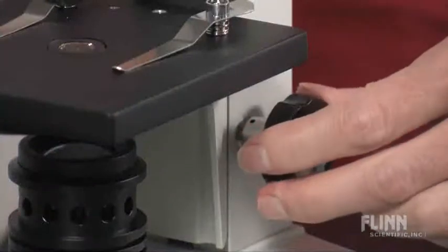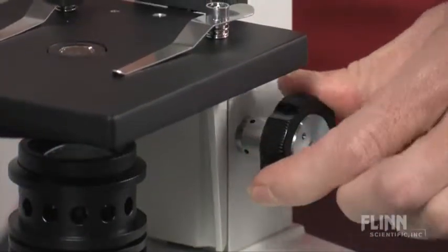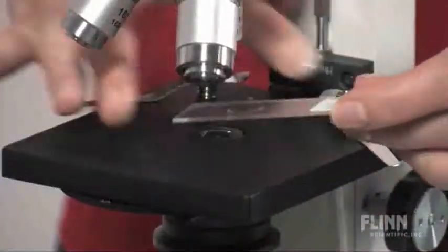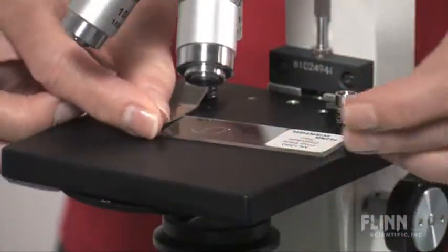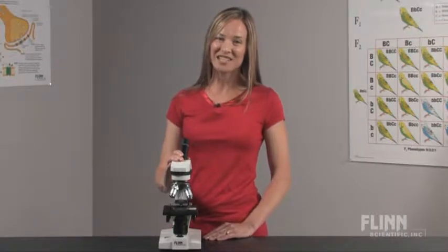There are no batteries to worry about charging, and only one focus knob for students to adjust. The large stage includes locked-on stage clips, so slides don't move around while students are focusing. The Middle School Compound Microscope is an affordable solution for your beginning microscopy students.